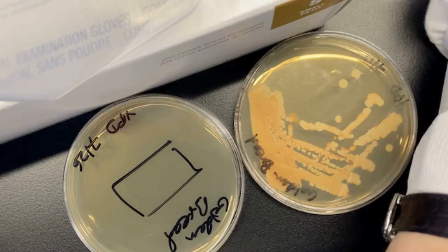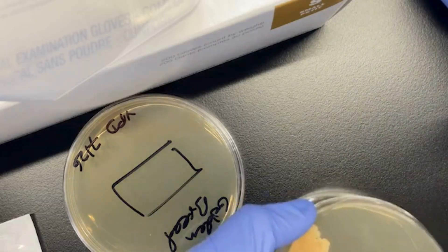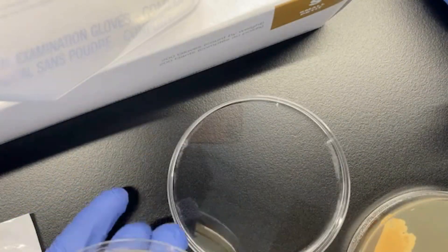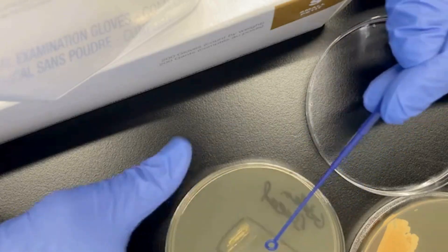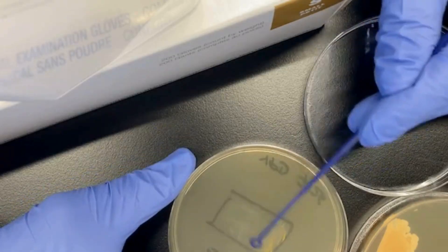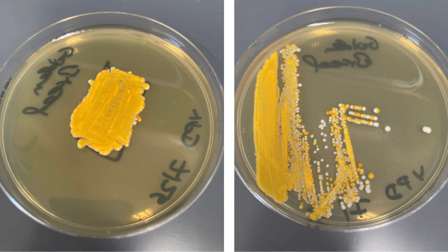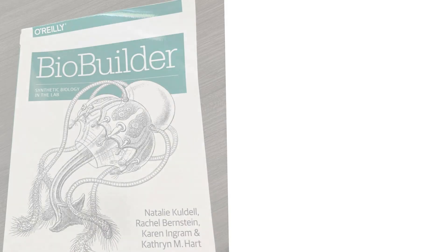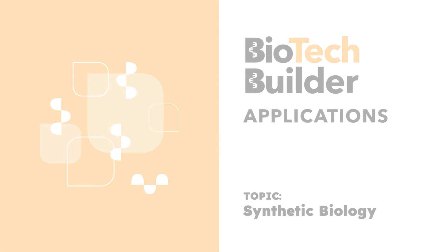I forgot to bring one more loop to the bench when it was time to make those patches of yeast cells. So here's a recording of me trying to do this with my phone while I also streak this out. You'll see I scooped up a single colony of yeast and with the patch go back and forth over a rectangular or square area on the surface of the YPD plate. One loop is enough, and then this petri dish gets incubated with the others — 48 hours at 30 degrees. This is what it looks like: the patch of yeast on the left and the single colonies on the right for the BioBuilder labs.